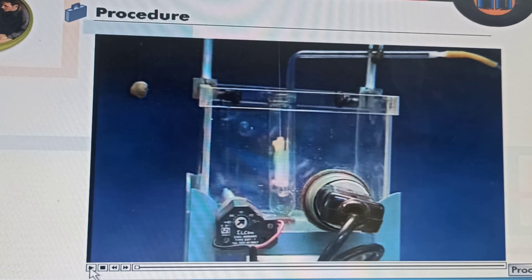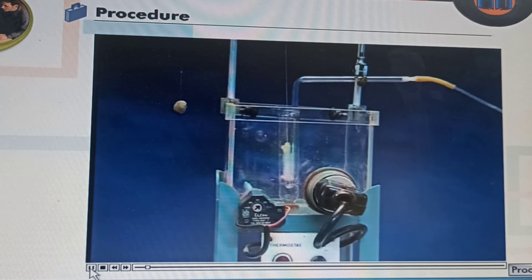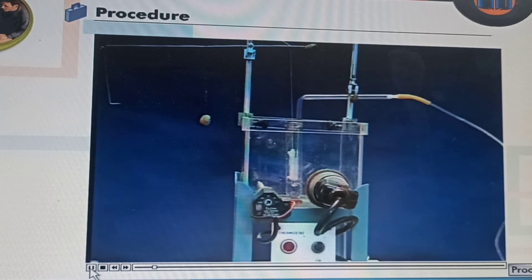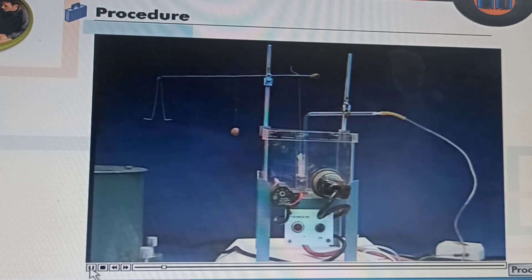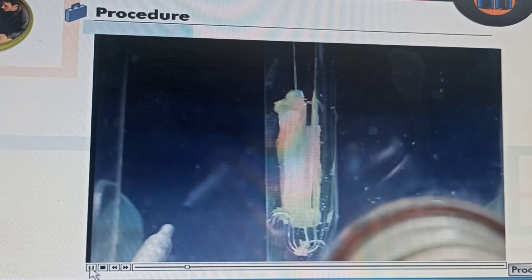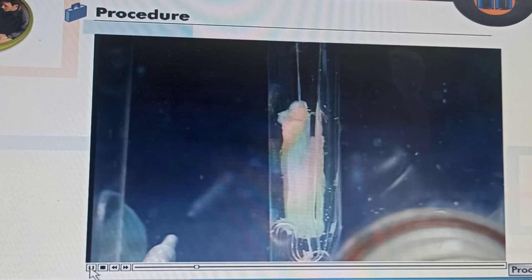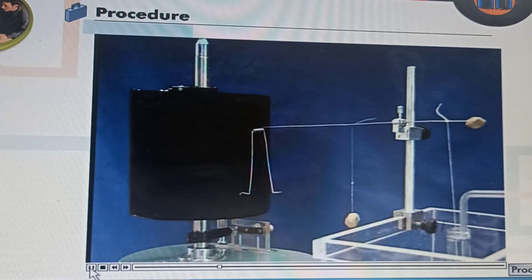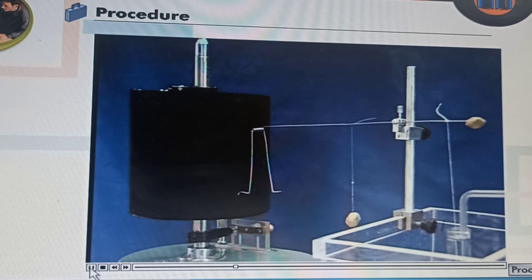Let us look at the procedure to study the effect of acetylcholine on rectus abdominis muscle. We have already learnt the isolation technique of frog's rectus abdominis muscle and the setup of assembly. Stabilize the mounted muscle preparation for 45 minutes in frog Ringer solution. During this period, wash the muscle preparation with fresh frog Ringer at least 4 times. Start the drum after stabilization and take a baseline for about 30 seconds on smoked paper.